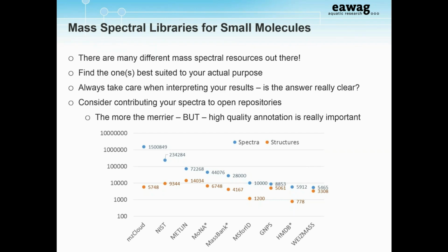For MassBank, they've actually got what's called Biomass Bank behind it, which is a separate collection, and this is only of biological unknowns, and these are also tagged with the organisms. Sometimes the way to actually get to some of that information is to use, again, a bigger compound database or some of these more specific collections, and use those to get you to the spectra for what you're interested in. So for example, HMDB, the Human Metabolome Database, where they have spectra, they've linked it.